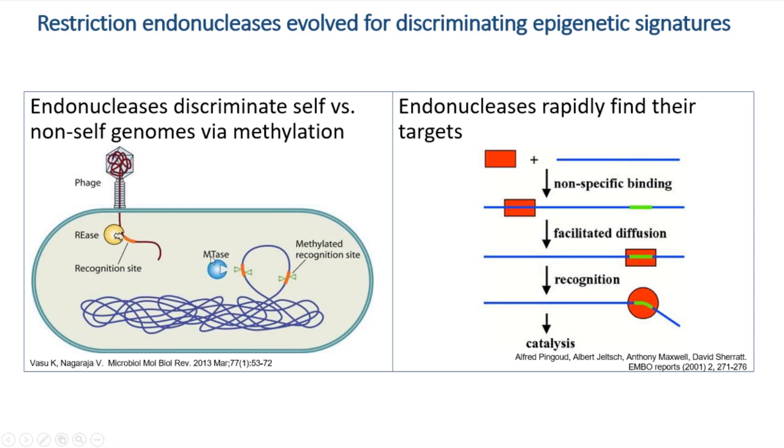And in making a methyltransferase to place that epigenetic mark, they would make a cognate restriction enzyme that would digest any DNA identified that did not have that cognate mark. So what you're looking at in this box is essentially a billion-year experiment to create a molecule, an enzyme, that has extremely high discrimination for target versus non-target.